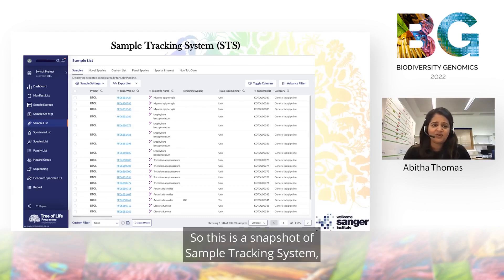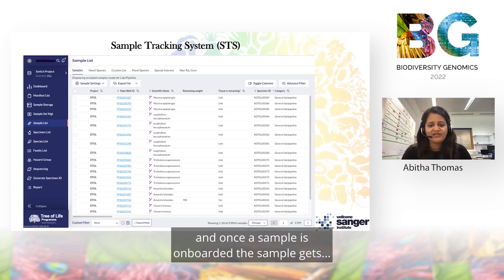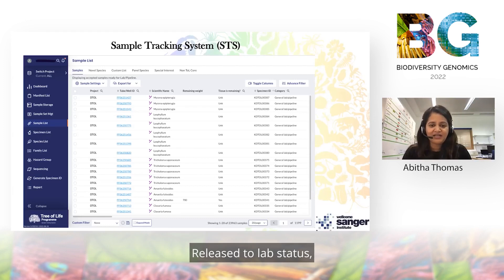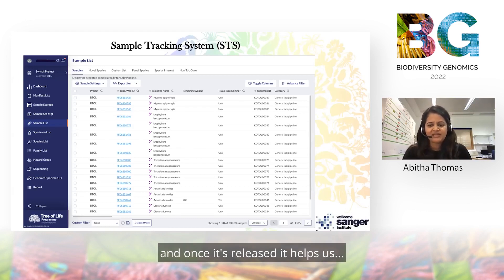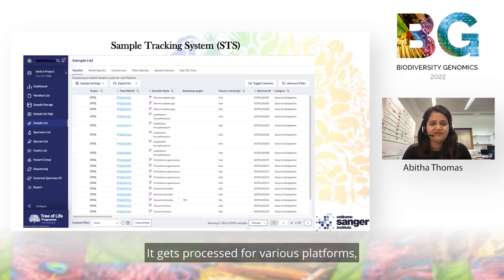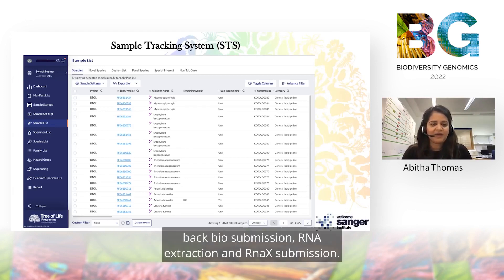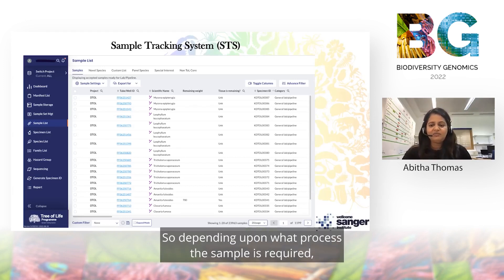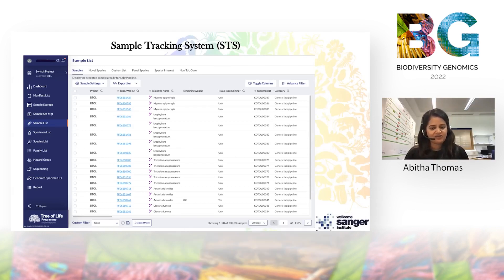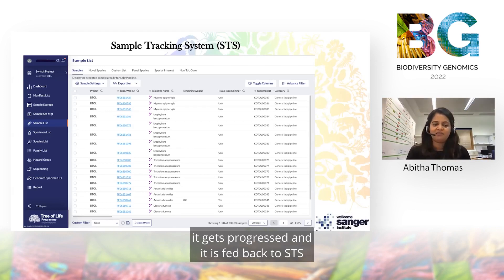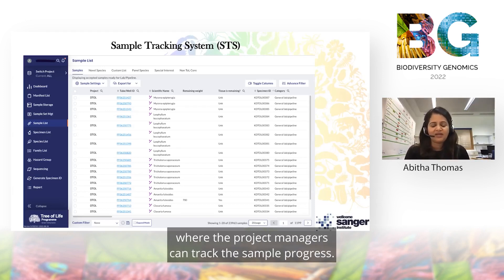This is a snapshot of the sample tracking system. Once a sample is onboarded, it gets the 'release to lab' status. Once released, it gets processed for various platforms — this could be Hi-C, DNA extraction, PacBio submission, RNA extraction, and RNA-seq submission. Depending upon what process the sample requires, it gets progressed and the results are fed back to STS where project managers can track the sample progress.